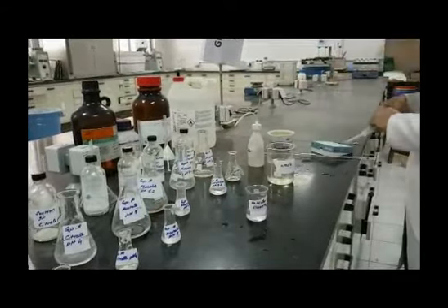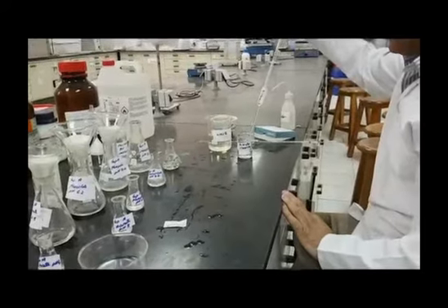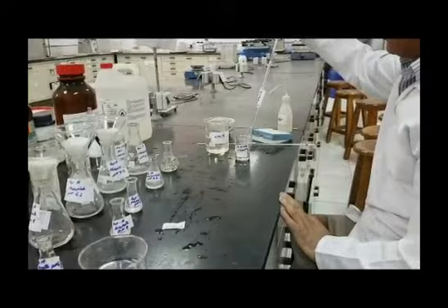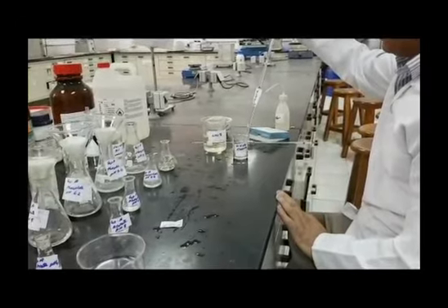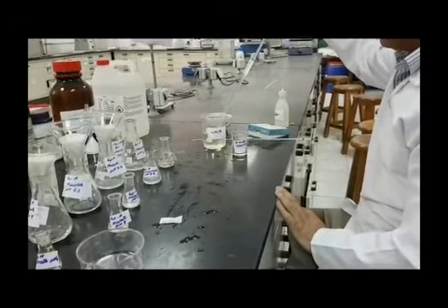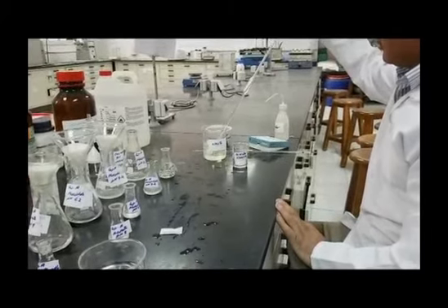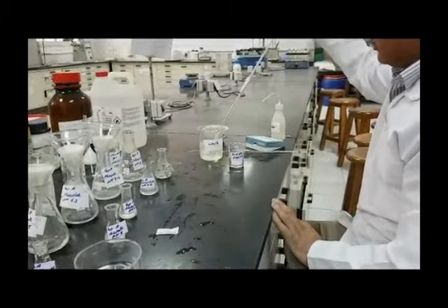And we will not need to do the zeroing steps 6 times. Actually, we will only do it once for all of the section. Only one time using sodium hydroxide.